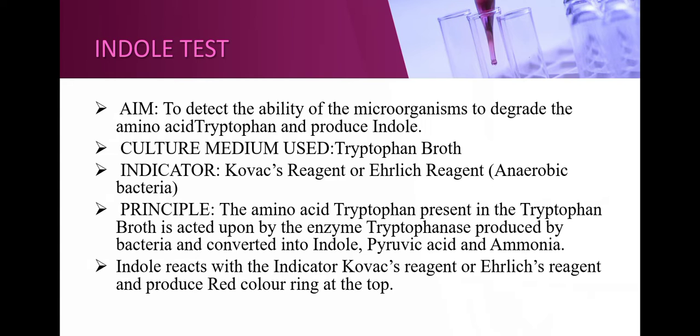Indole reacts with the indicator, Kovac's reagent or Ehrlich's reagent, and produces a red color ring at the top.